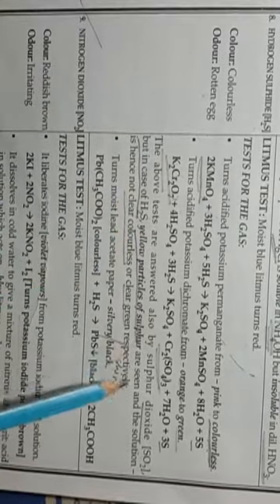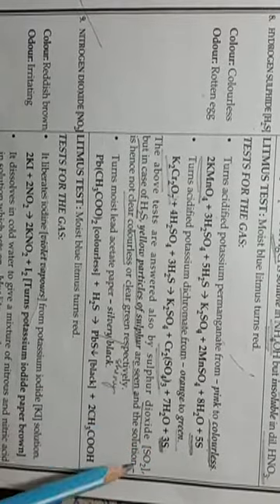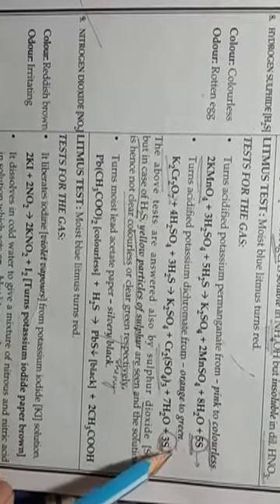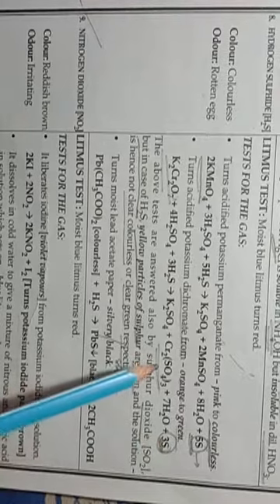Okay students, the notable point is that the above tests are answered also by sulfur dioxide, but in the case of H2S, yellow particles of sulfur are seen. Sulfur is also formed here, and the solution is hence not clear colorless or clear green respectively. Due to the formation of yellow sulfur particles, the color of the solution is not clear.